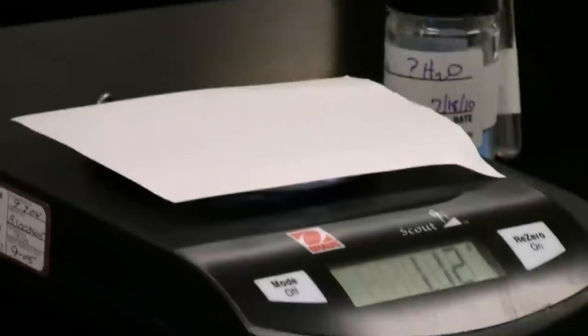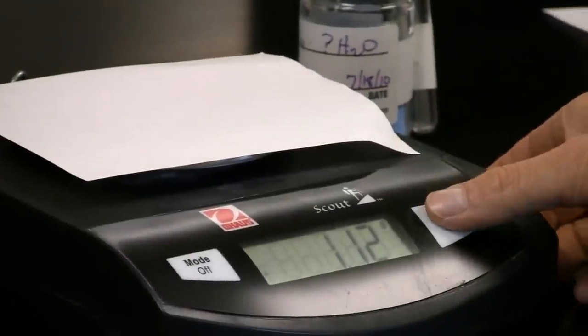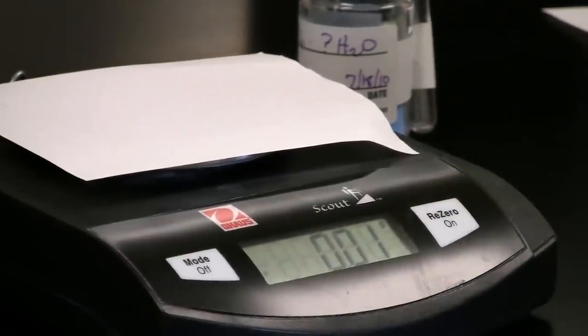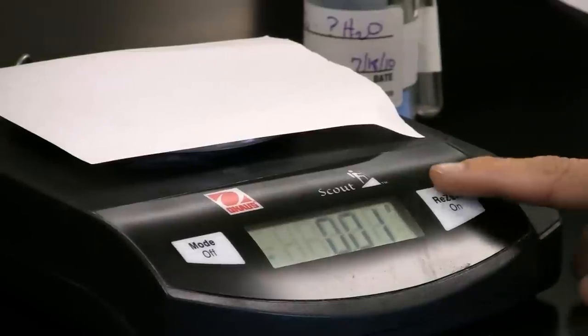At this point, hit the re-zero button to zero out the mass of the paper. Add your sample and record your measurement.